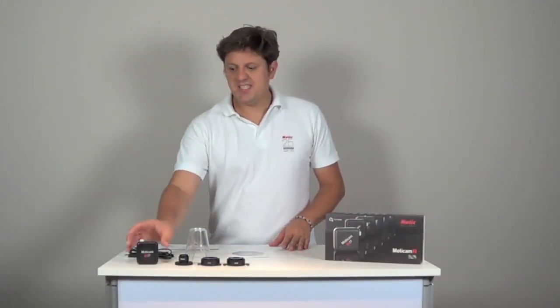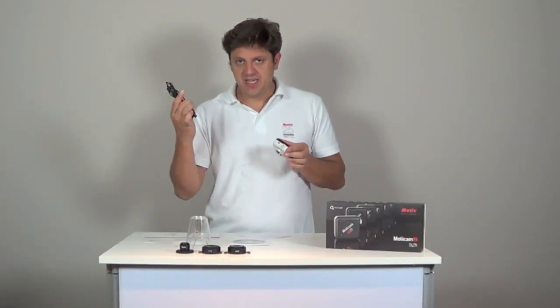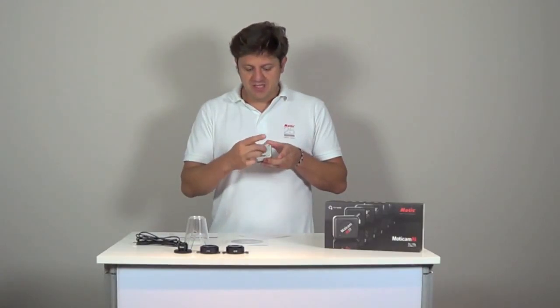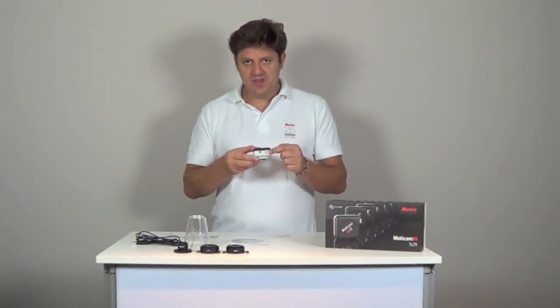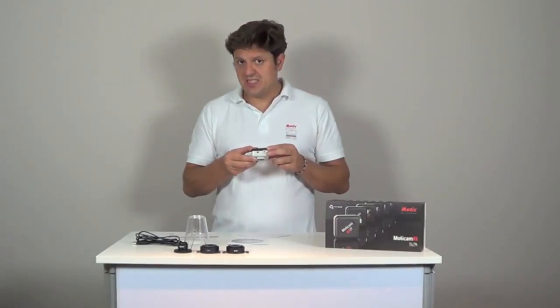The Maticam gets its power from the USB. There is a mini USB plug at the back to connect the camera to a computer using the USB cable. When the camera is working, the green LED is on. At the bottom of the camera there is an opening where you can see the image sensor behind the protection glass. This opening has a C-mount thread to screw the camera to a microscope. There is also another thread at the back to screw the camera onto a camera tripod or onto a gooseneck stand.